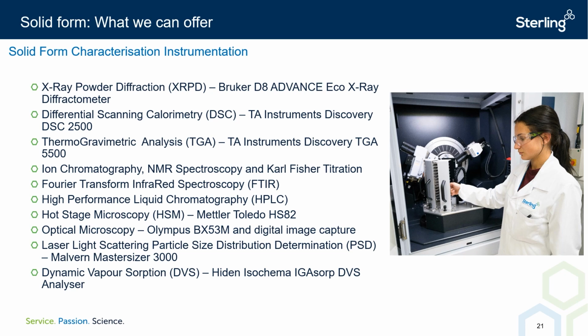To support API version determination, thermal characterization by differential scanning calorimetry and thermogravimetric analysis can be employed to reveal thermal features unique to each API version, similar to XRPD data. The thermal events can identify an API version's melting point, the presence of additional thermal events, potentially indicative of mixed versions or enantiotropism, determine the onset of decomposition, and potentially differentiate between channel and stoichiometric solvates and hydrates.